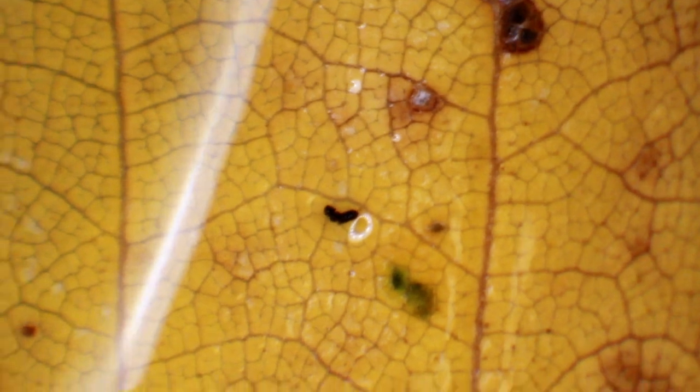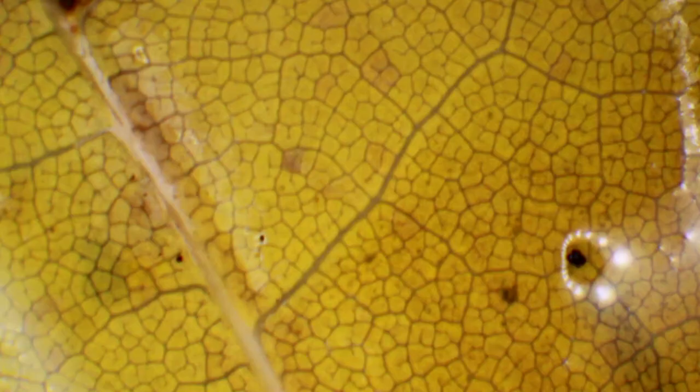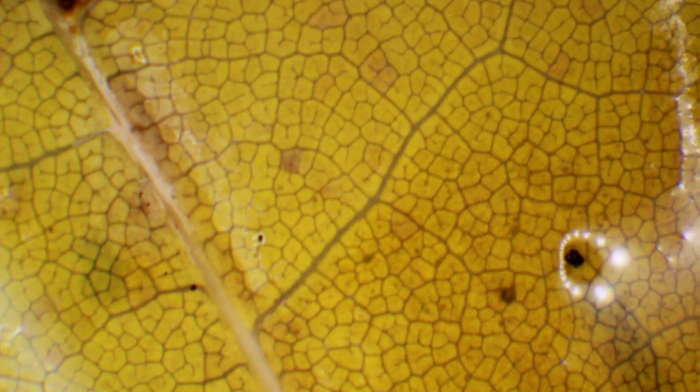Under the stereo microscope on day one, the leaf still looks very nice — everything's still yellow. This is the ginkgo leaf, for example. You can see the pigments of the leaf are still present, and you can also see the nice reflection of the microscope lamp.